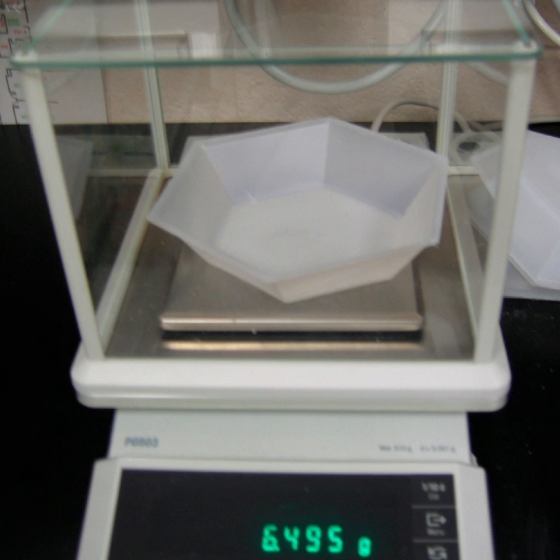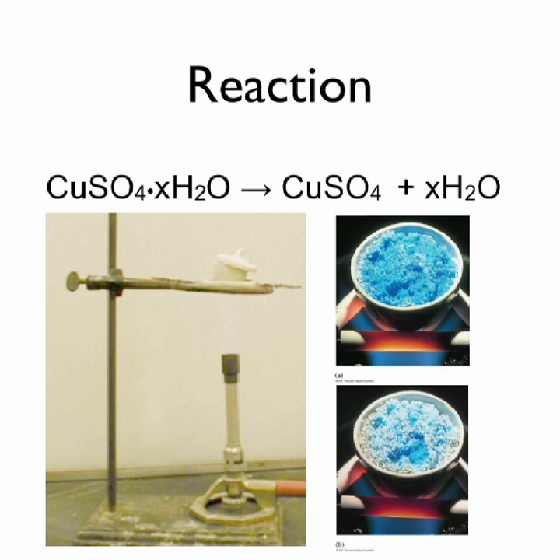Use a spatula to break up any large pieces of the substance by pressing the pieces against the wall of the crucible. Measure and record the mass of the crucible cover and the compound. Then set up a ring stand, ring, and clay triangle for heating the sample. Rest the crucible on the clay triangle, as shown. Tip the cover slightly so that it does not fit snugly on top of the crucible.